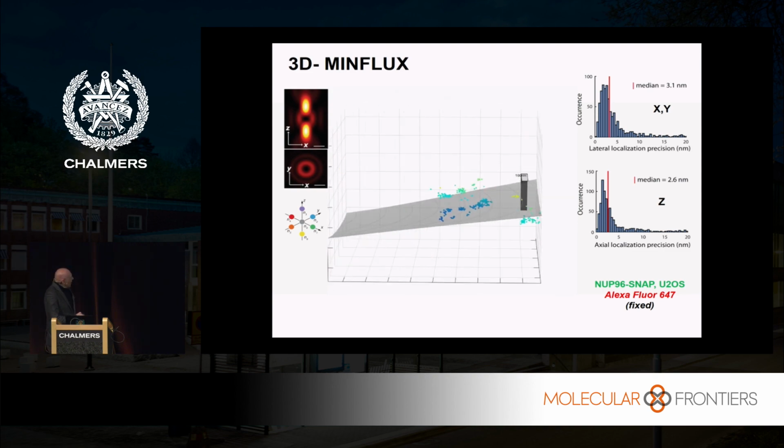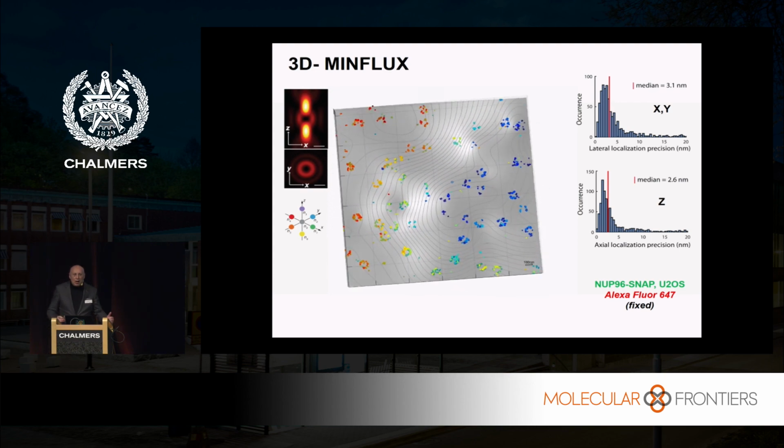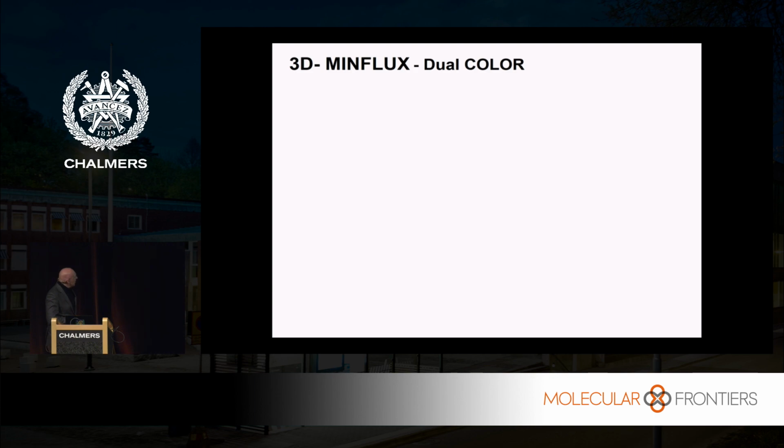Now, you say, if it's spotty, it's because it's molecules. And the challenge now is for the real chemists, of course, to do fantastic labeling that really labels every molecule that you want to see. So the challenge is now basically with the organic chemists to get good labels or to do the labeling perfectly right. But from the physics, from the concept or so, I think this matter is virtually closed, if you ask me. Having reached this resolution now, it's very obvious.